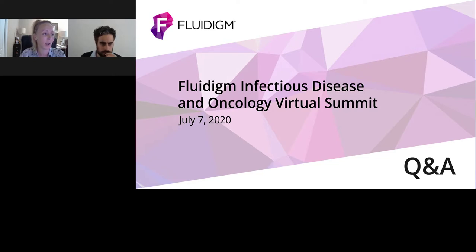Have you been using IMC for other purposes than immune oncology? Yeah, so the lab has been employing imaging mass cytometry in other projects as well. Basically, any setting that requires the use of multiple markers to assess a phenotype of a cell. So for instance, we also have a project that is focusing on signaling. And there what we have built is a panel that is mostly constituted by phospho-specific antibodies to study signaling in tumors.